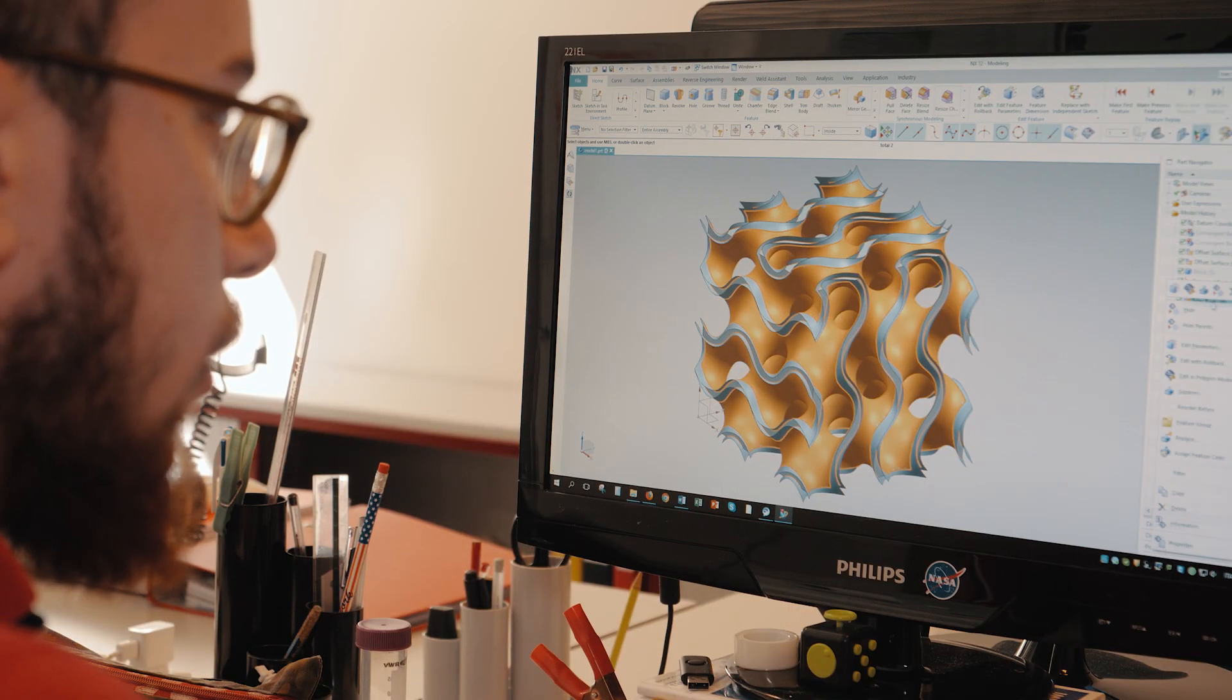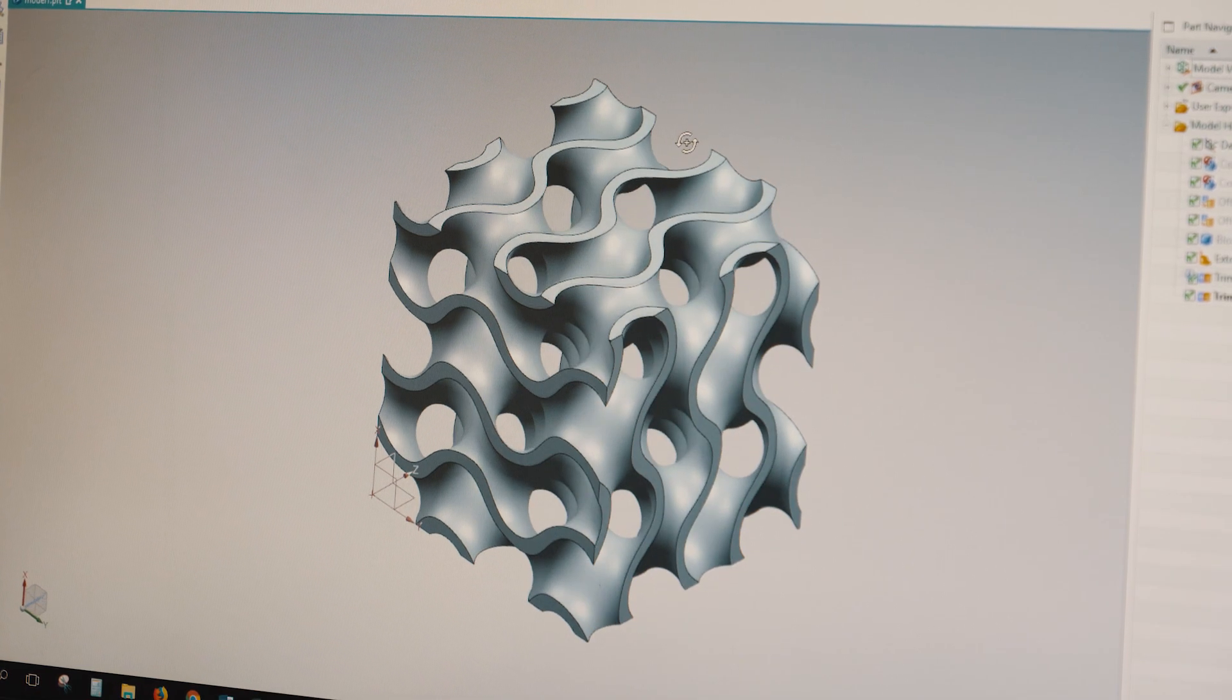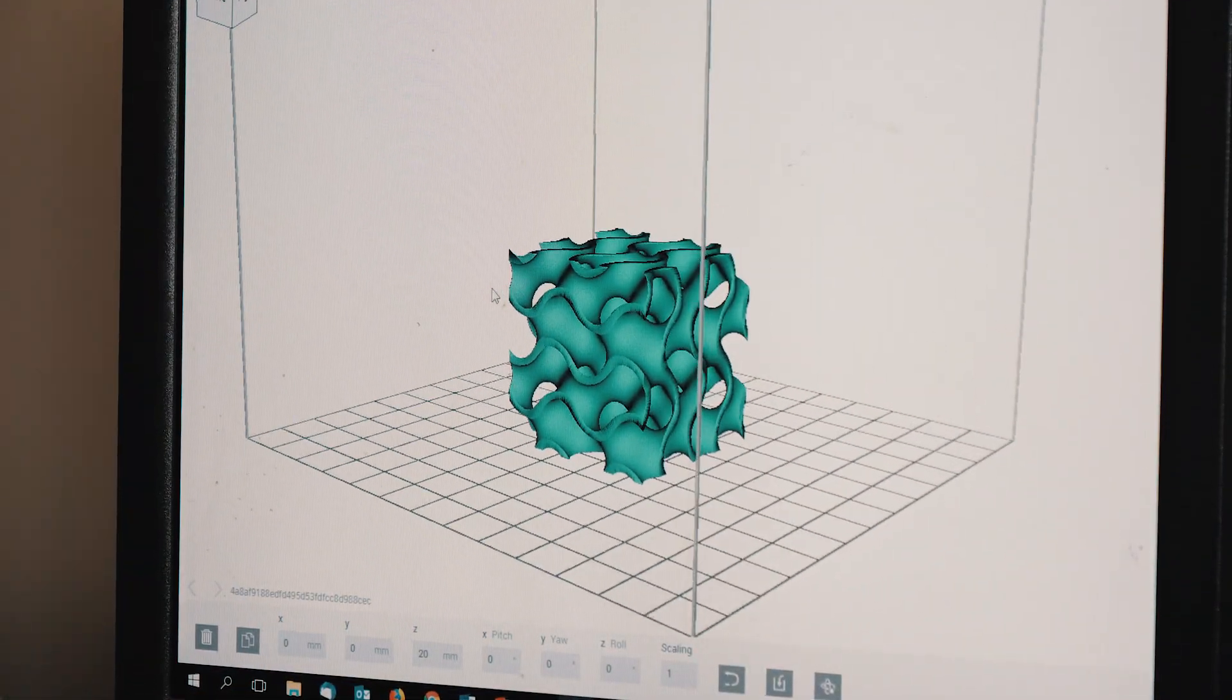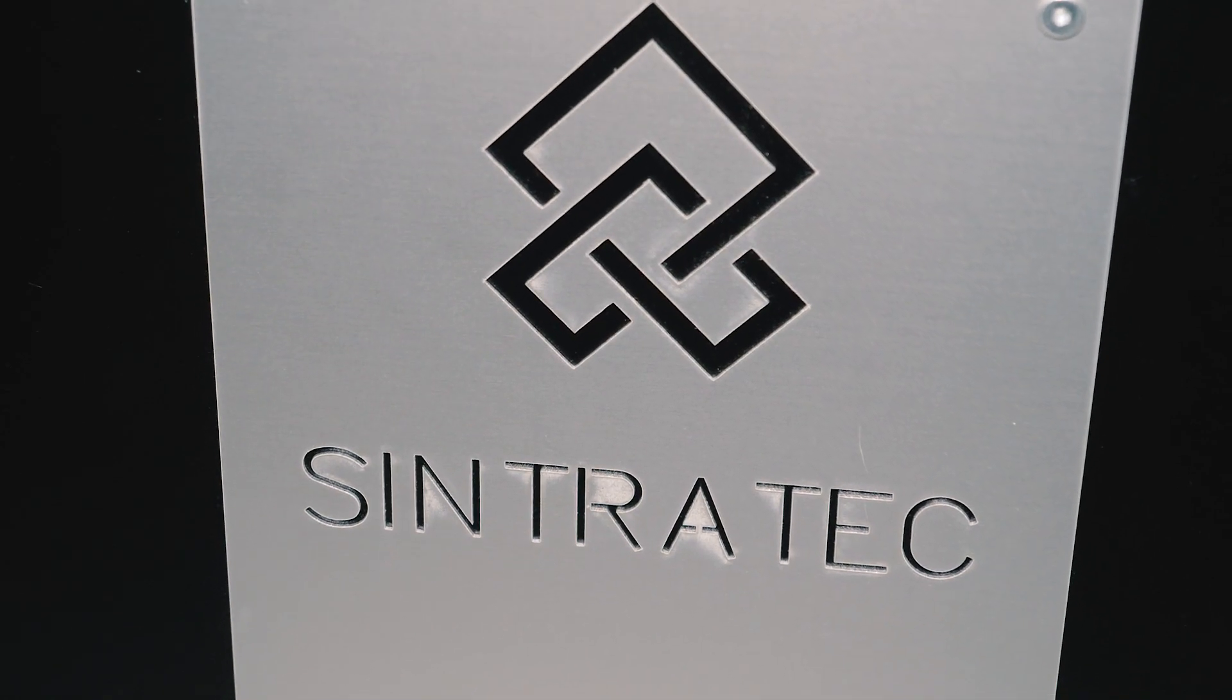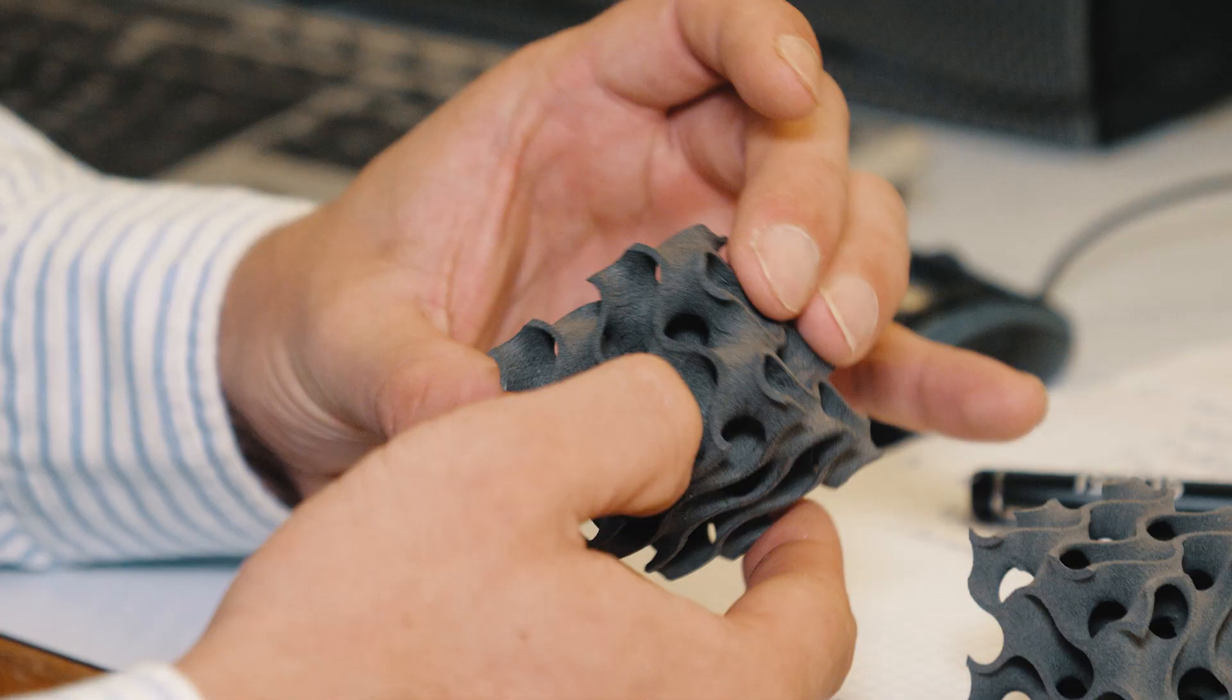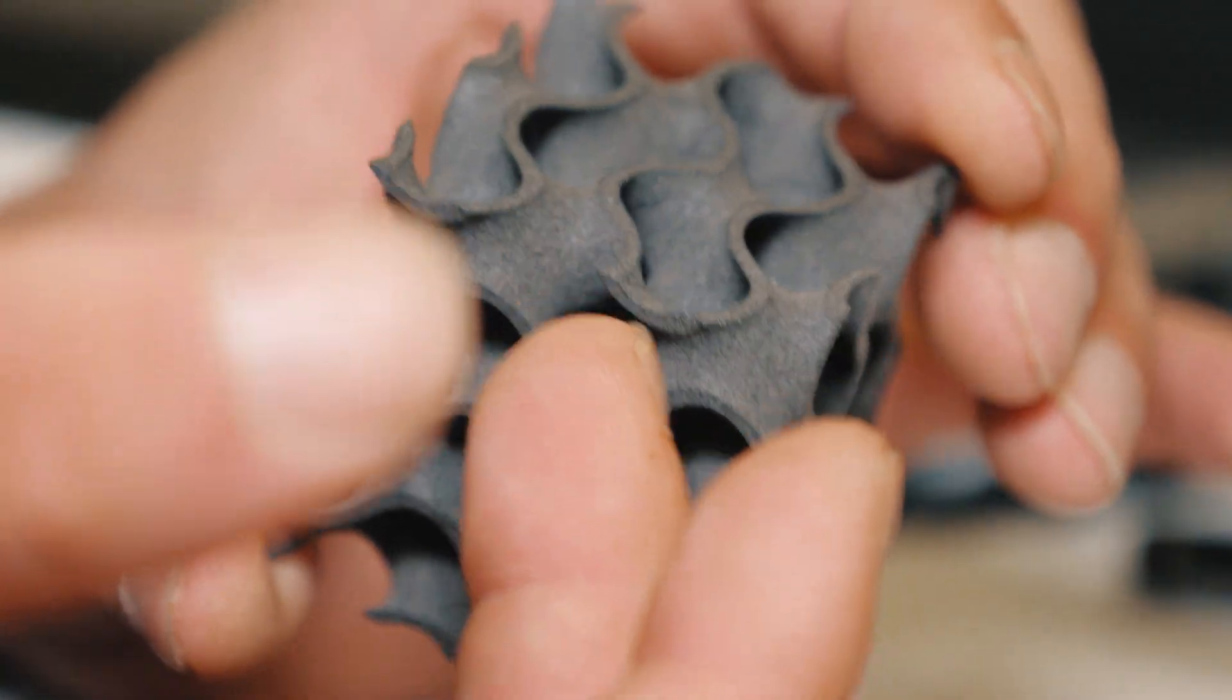Up to now we were using just SLA technique but with that it was not possible to achieve porous objects. This is why we are now investigating the SLS technique. We bought this Sintratech kit which allows us to produce porous components. For example these porous structures are called gyroid.